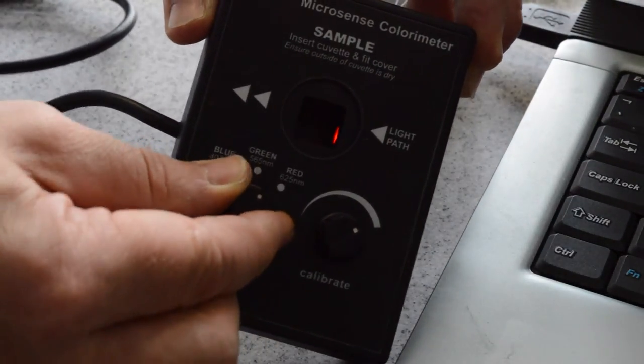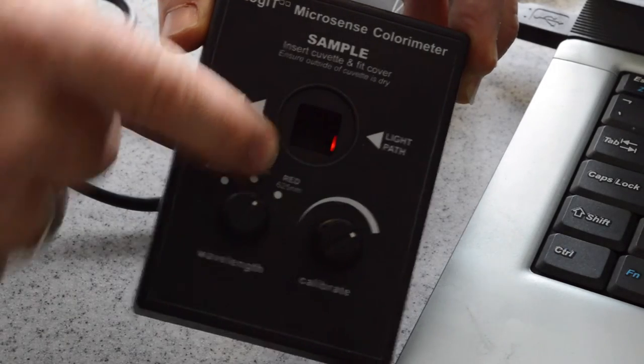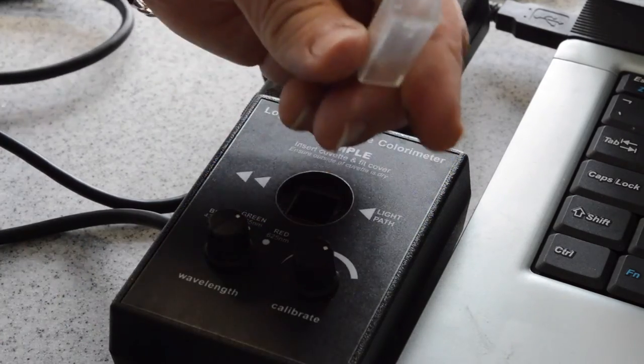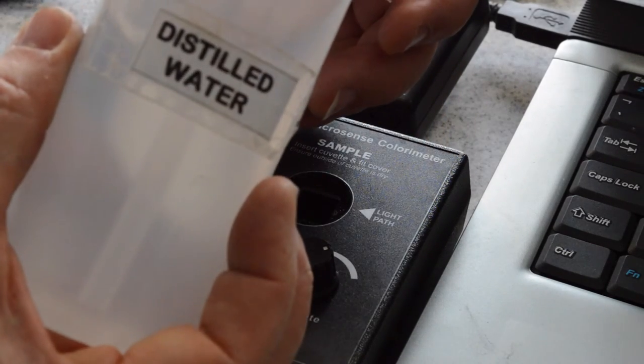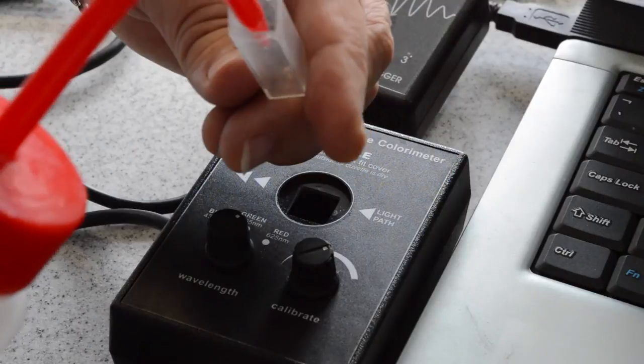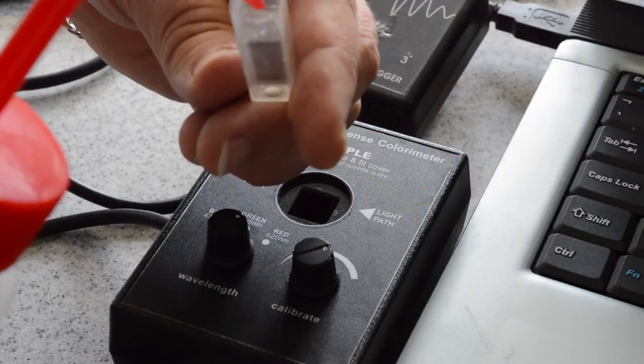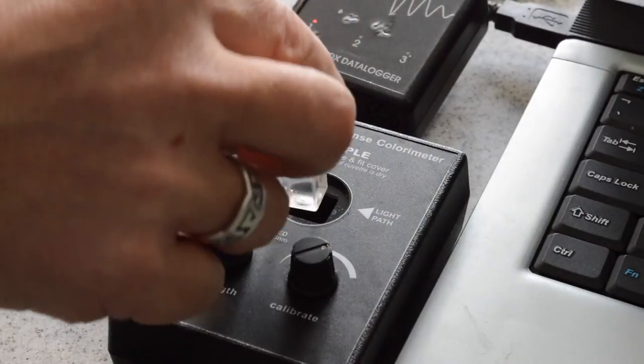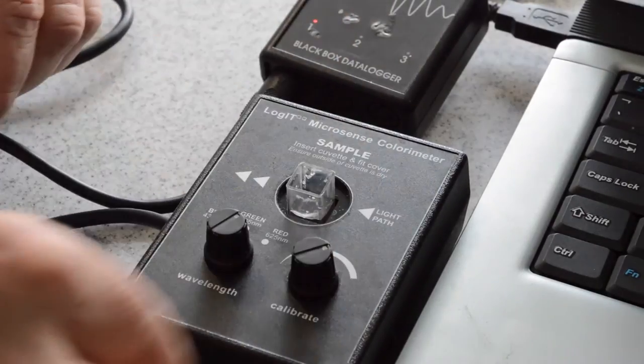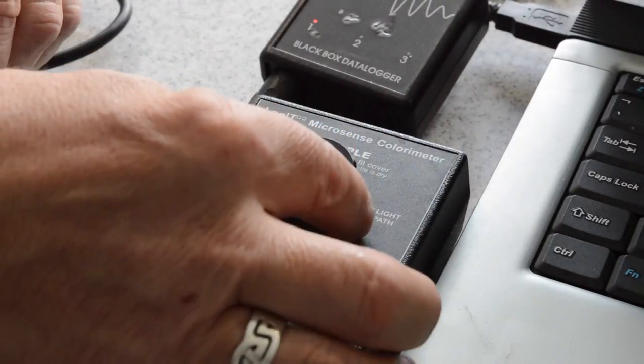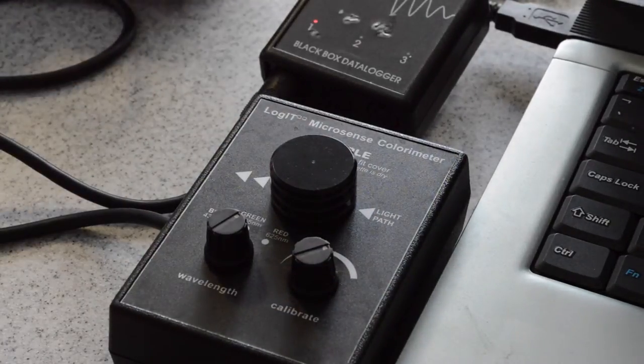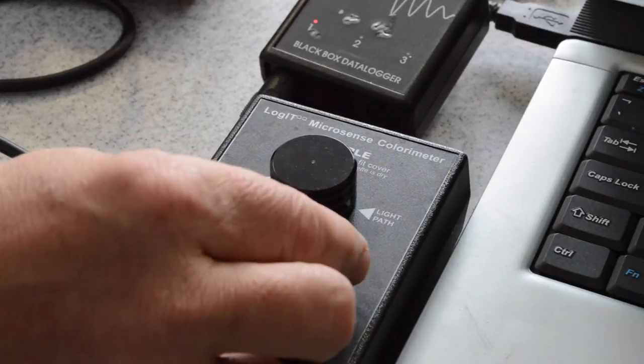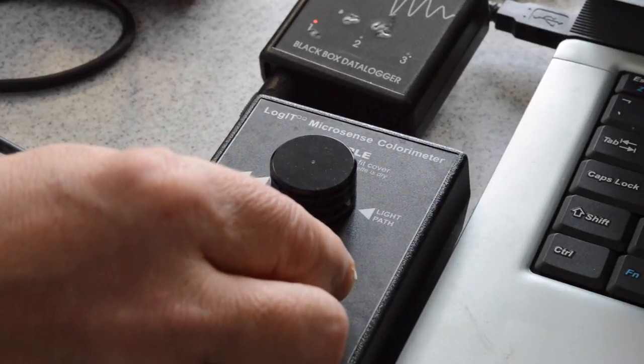For this experiment, use the red spectrum. This is a cuvette. To calibrate the colorimeter, fill the cuvette with distilled water, place into the colorimeter and place on the cap. Then calibrate the colorimeter until a value of 100 is seen on the screen.